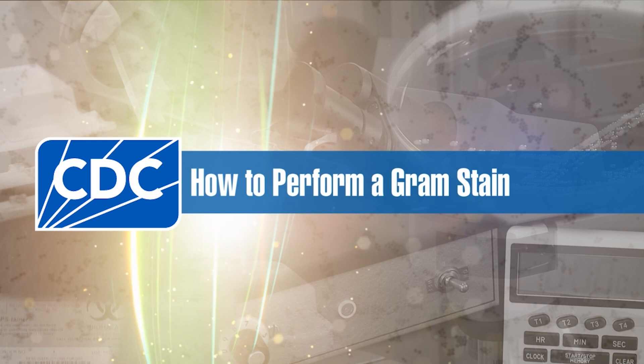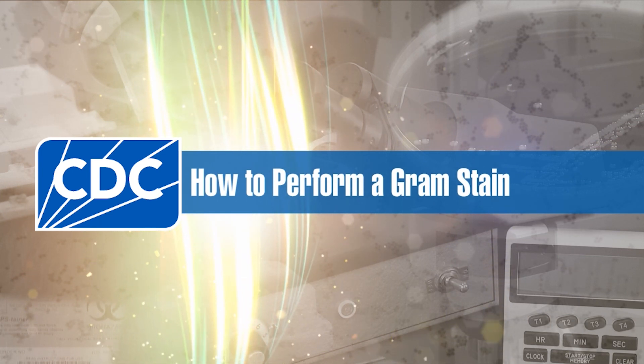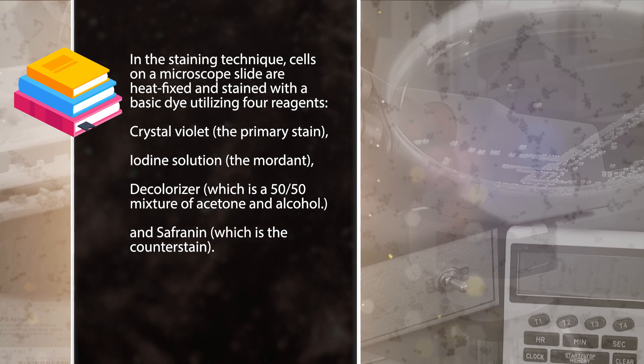The gram stain is a laboratory technique commonly used to differentiate bacterial species into two large groups, gram positive and gram negative bacteria. The technique is based on the chemical and physical properties of their respective cell walls.